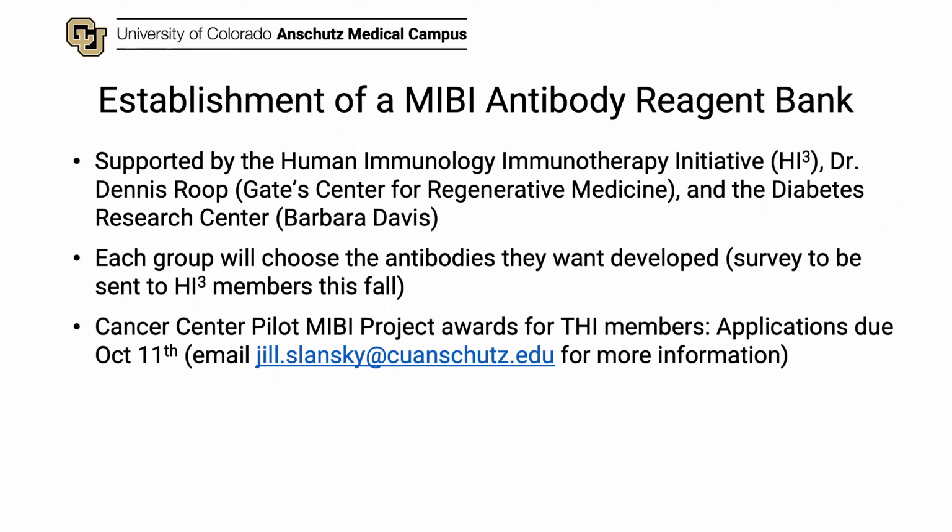We are very happy to announce that we are establishing a MIBI antibody reagent bank, very similar to our CyTOF reagent bank that's available in a collaboration between the Cancer Center Flow Core and the HEMSR. So we are taking that model and using it for our MIBI antibody reagent bank. This antibody bank is currently supported by HI3, Dr. Dennis Roop, and the Diabetes Research Center.